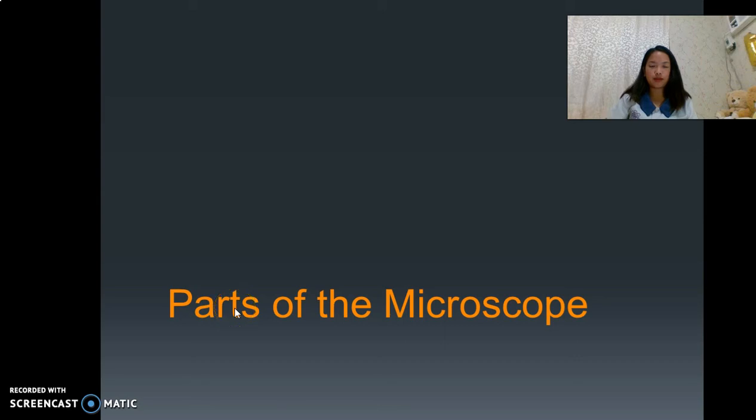Good morning everyone. Today we will discuss the parts of the microscope.